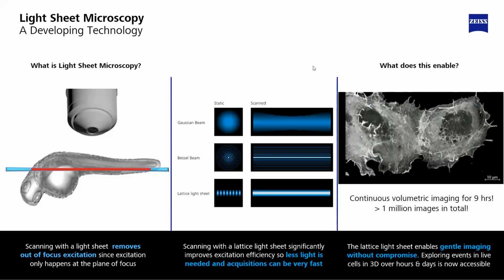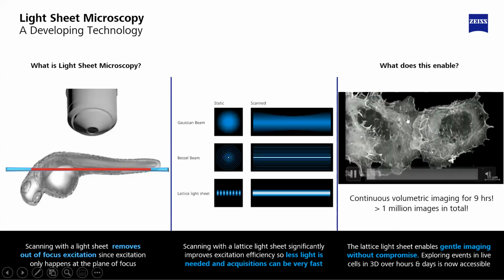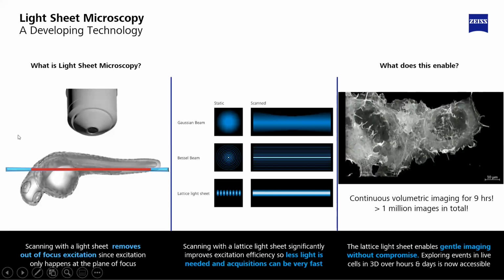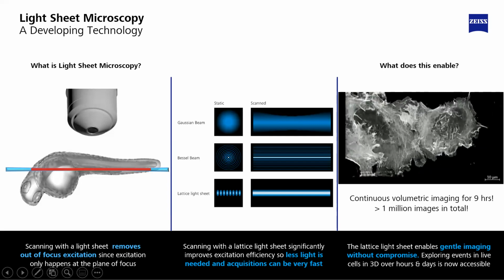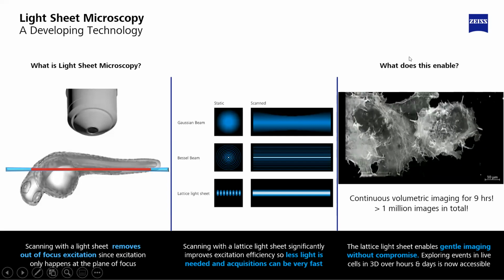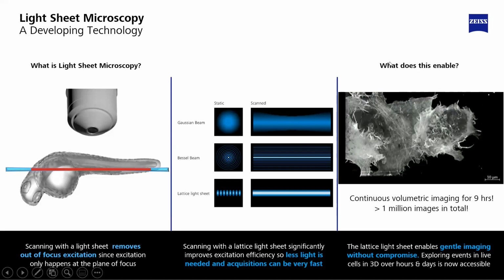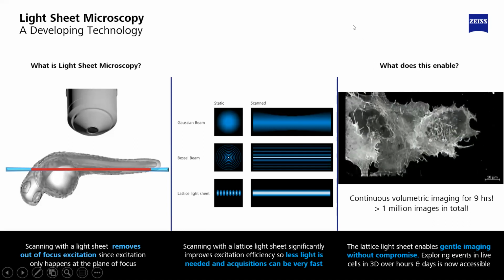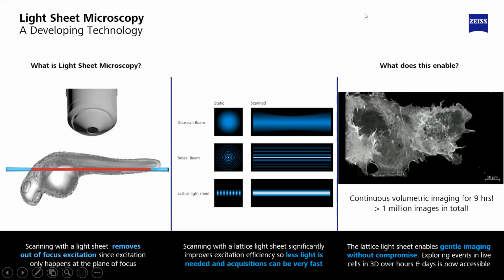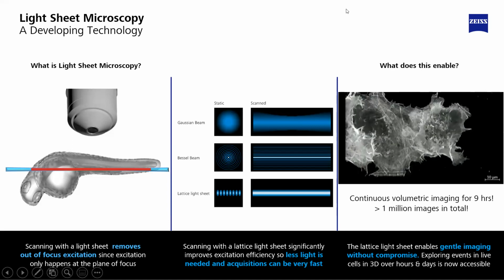of continuous imaging. So the time lapse that I'm showing you here, I'm not going to let it play because it actually was imaged for 9 hours continuously and is comprised of over 1 million images in this one particular volumetric acquisition. But you can appreciate that there are really fast and really dynamic actin-based ruffles that you can visualize in these cells throughout the duration of this movie.